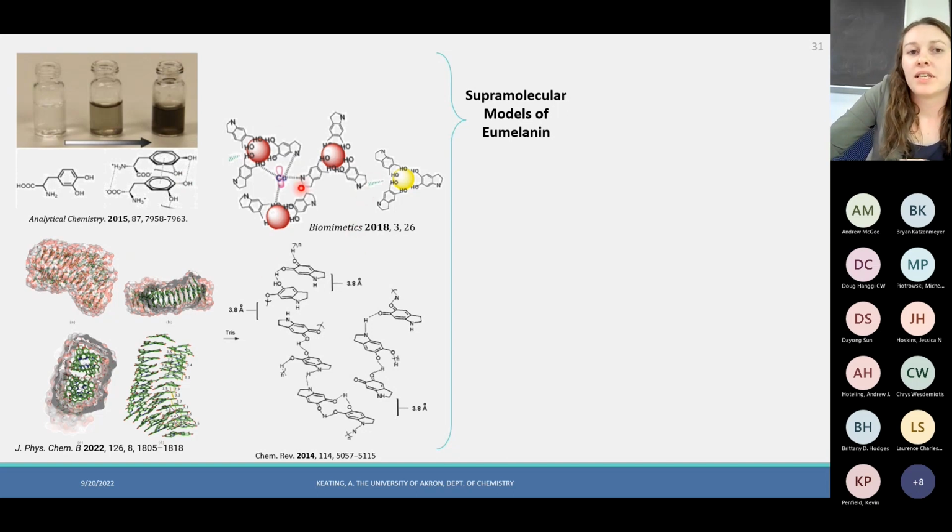Here we have the DHI oligomers chelating to different metals and forming these structures in non-covalent ways. Ultimately, these two structures have been reported recently, and this angstrom separation between the non-covalent aggregates has been a big point of interest for a lot of the community.